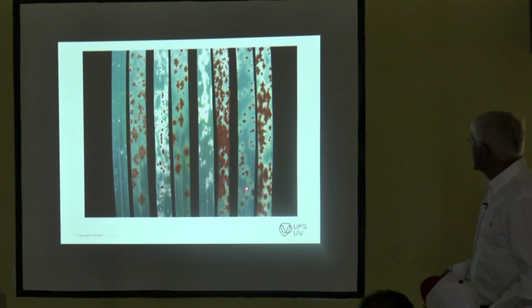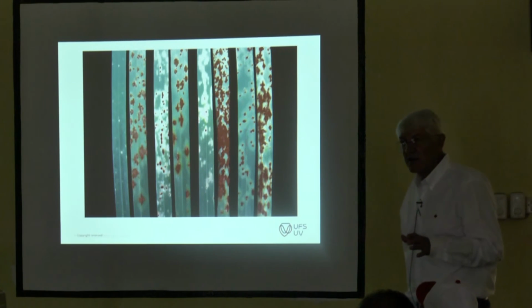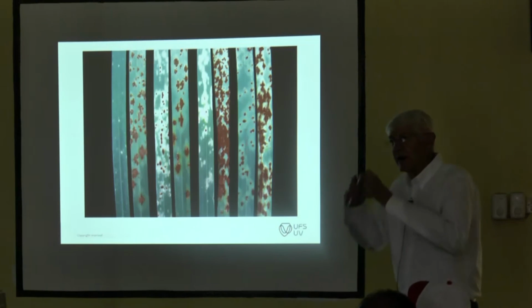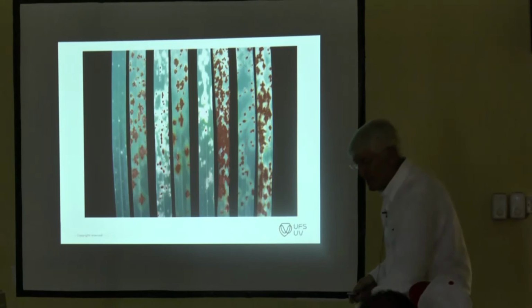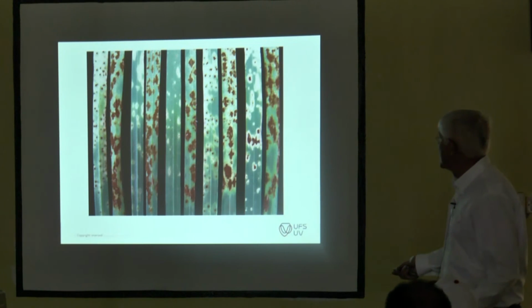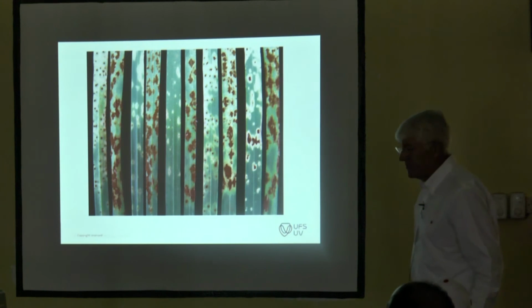Then you have an intermediate size one without the typical islands, but clearly smaller than your susceptible. And it's not the textbook 2, but it is probably in the 2 range somewhere. The textbook 2 has what? It's got a green island surrounding the stem rust pustule. Just some more examples. We don't have to go through all of these. Low, low, low, and again, a typical X.